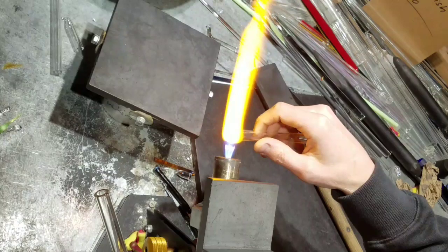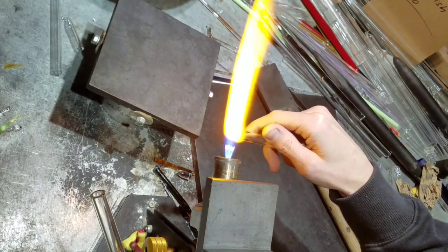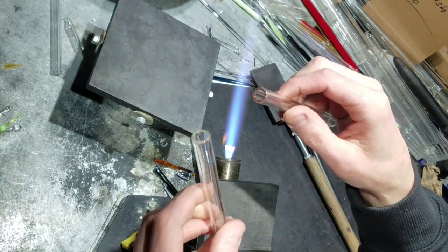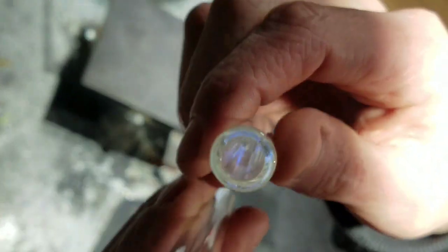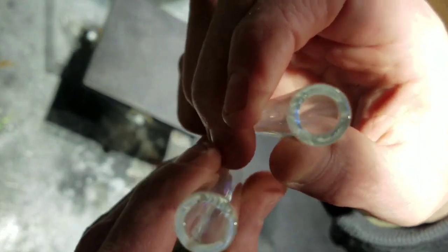Go ahead and fire polish this side up. And there you can see it — you always want to do that to your blow tubes, to anything pretty much. It's a lot safer.